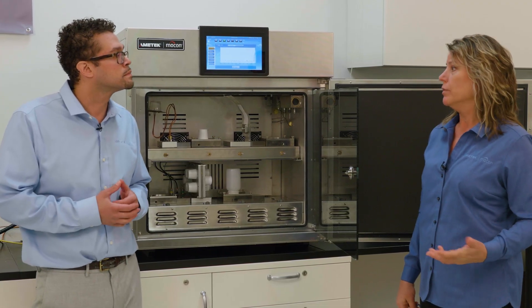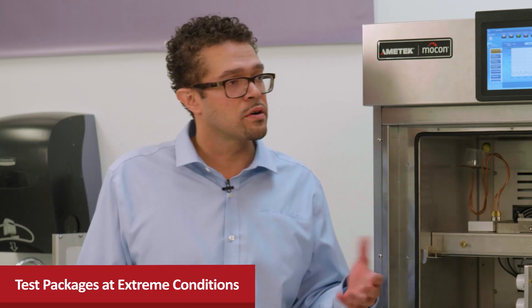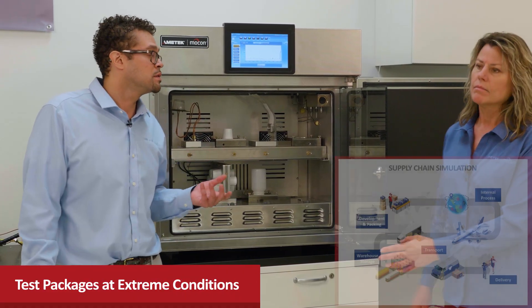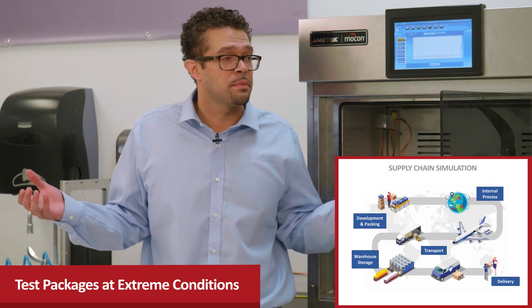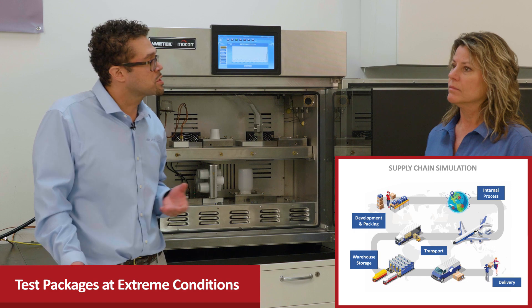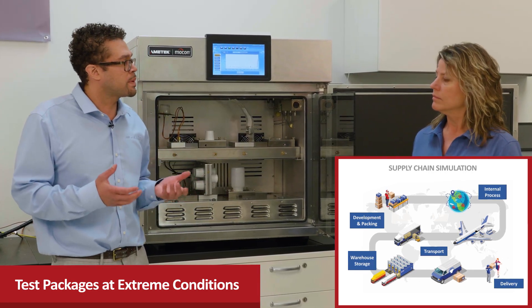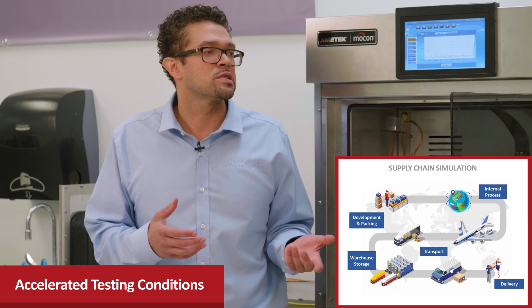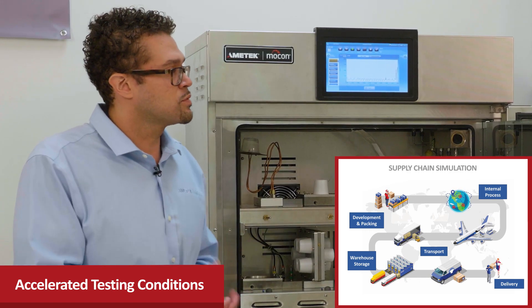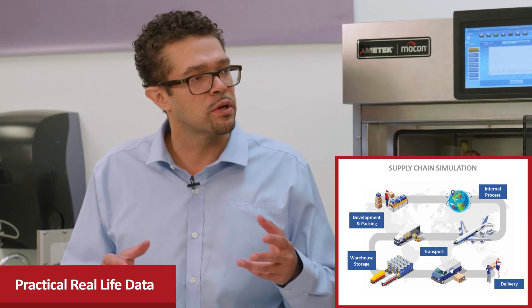Over the years, we've tested many bottles and thermoform trays for oxygen transmission rate at ambient lab temperatures and conditions. The advantage of testing at higher or lower temperatures is because you can actually simulate your supply chain. Say you're in production and you want to distribute, and you have to put your products on the back of a hot semi that has a high humidified environment — much warmer than a store shelf. This instrument allows you to simulate those actual conditions so you can better understand the rigors placed upon your package system during transportation through the supply chain. It also allows you to do accelerated testing, which a lot of customers prefer, and it provides you with the most consistent real life data.